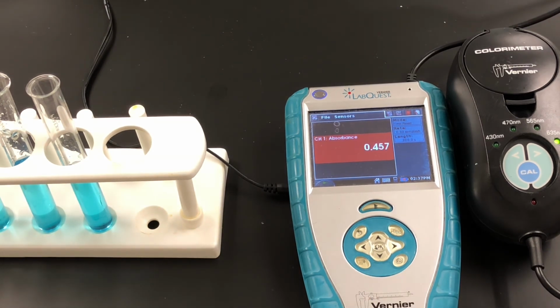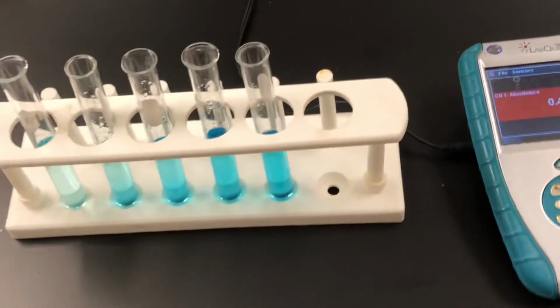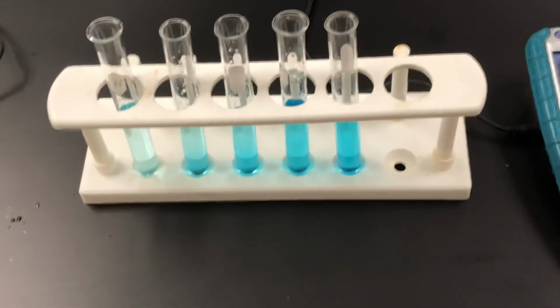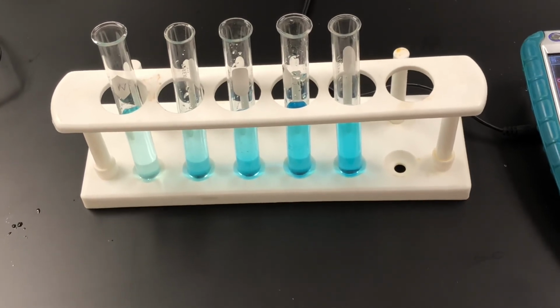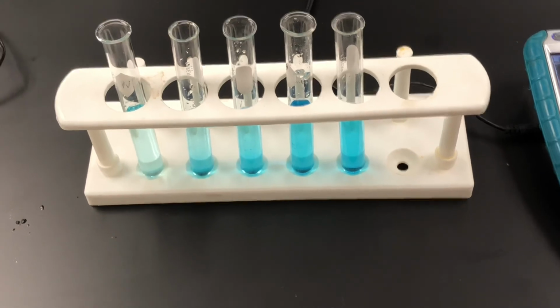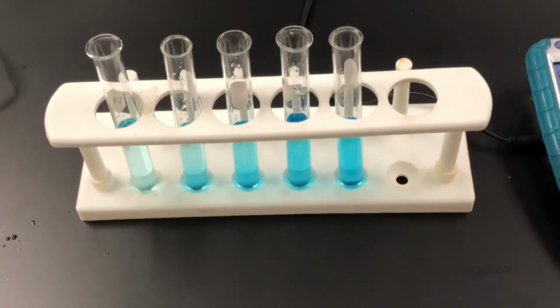All right. So at this point, we have the absorbances for our knowns. So we should be able to take those values and graph them. Now, there's a Google Sheets that has been attached to the classroom assignment. And you basically want to put your information into there. We should be graphing concentration versus absorbance. And we can insert a line of best fit.